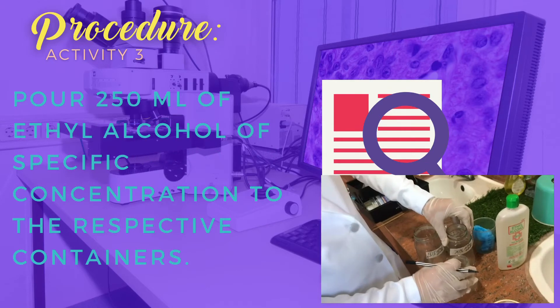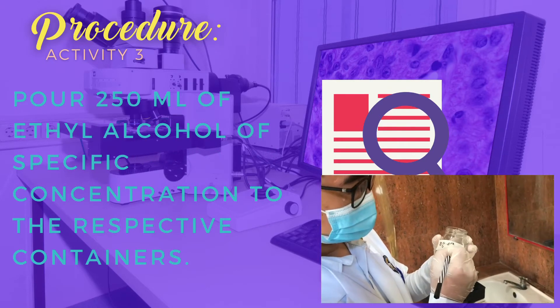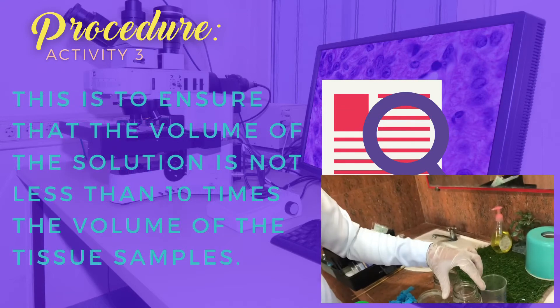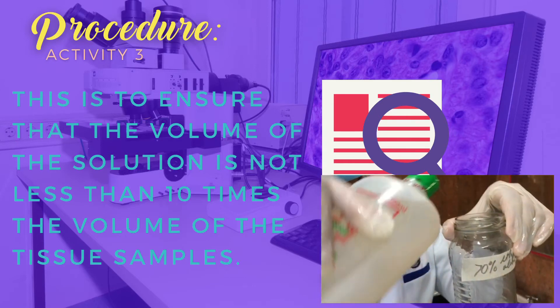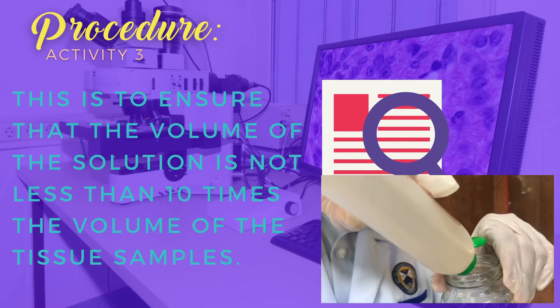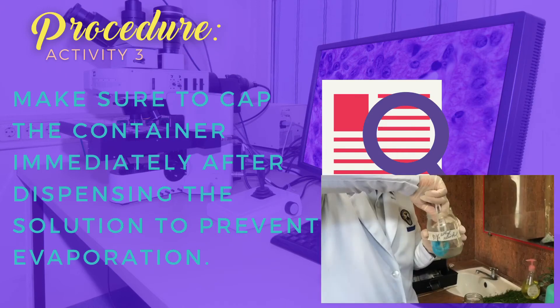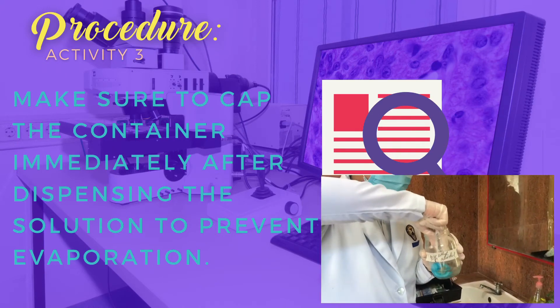Next, pour 250 ml of ethyl alcohol of the specific concentration into their respective containers. This is to ensure that the volume of the solution is not less than 10 times the volume of the tissue sample. Make sure to cap the container immediately after dispensing the solution to prevent evaporation.